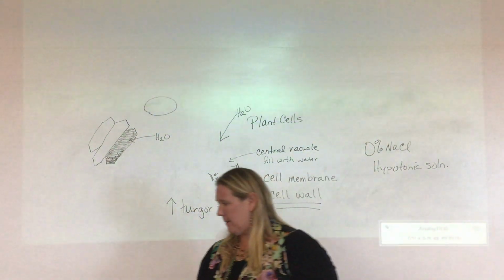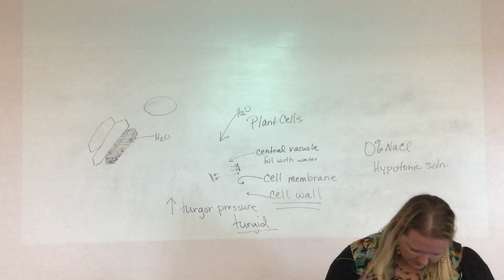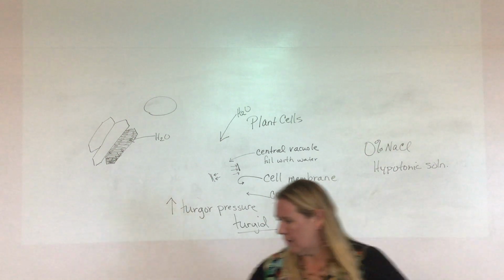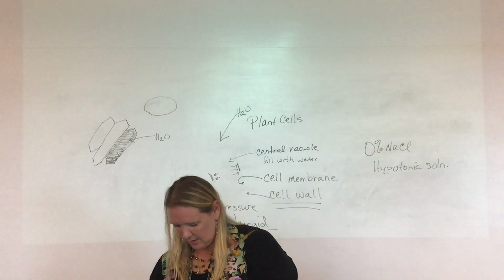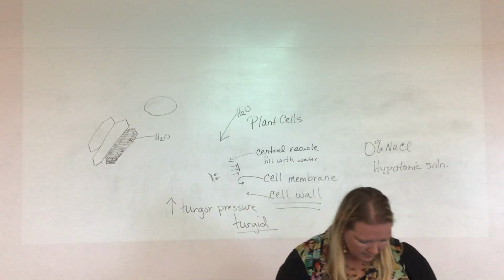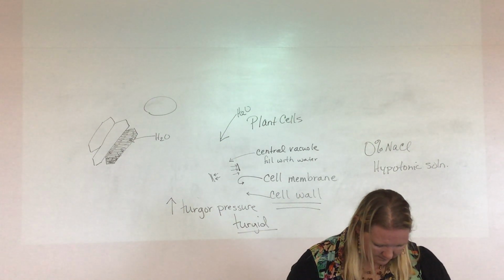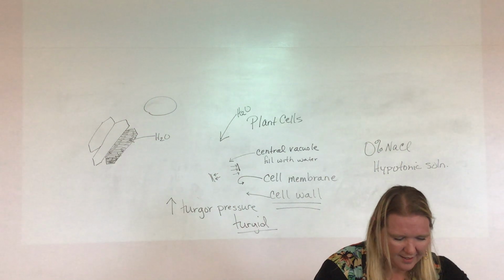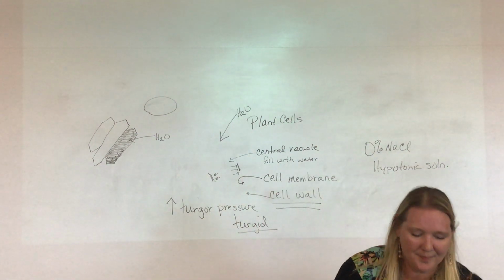And I need salt solution. And try to do a clean cover slip this time. Hard to tell. It's a long lab. Luckily you can pause and come back.